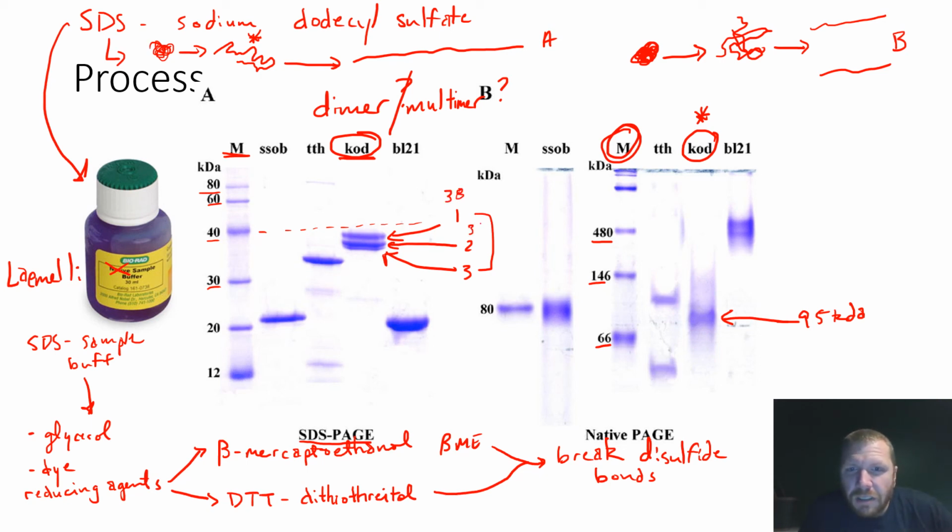This one's 36 kilodaltons, and I'm talking about the molecular mass of these proteins, and maybe this one's 35.5. Well, if I added those up, that would be 90, 104, 109.5. Approximately 109.5 kilodaltons for the overall size of that protein.